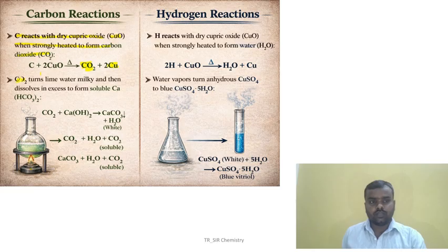Now, this CO2 gas turns lime water milky. This point is important, guys. This is the question we'll frame on this. So CO2 turns lime water milky, then dissolves in excess to form a soluble complex, that is calcium bicarbonate will form. So these are the reactions. Excess amount we are passing here.